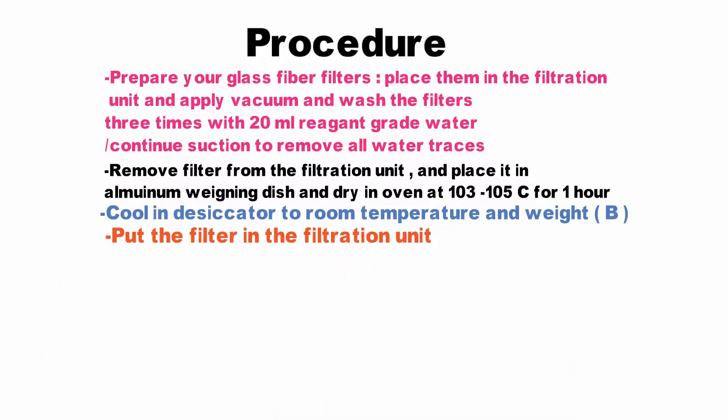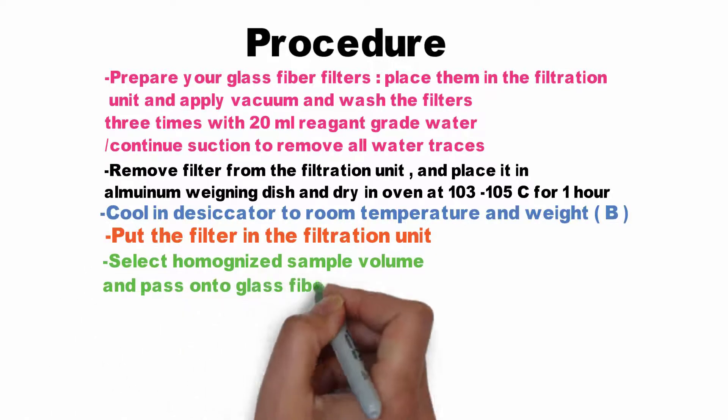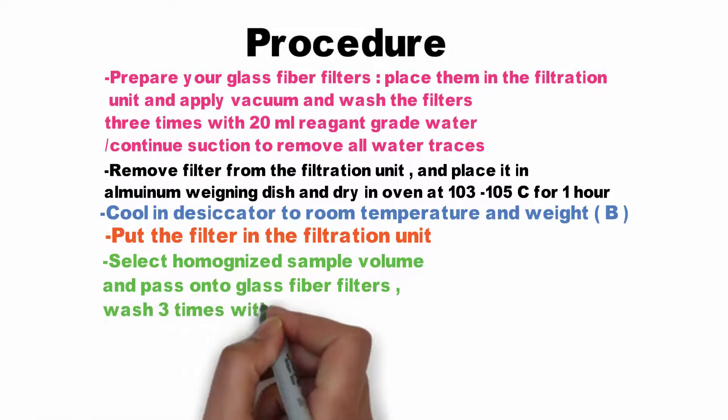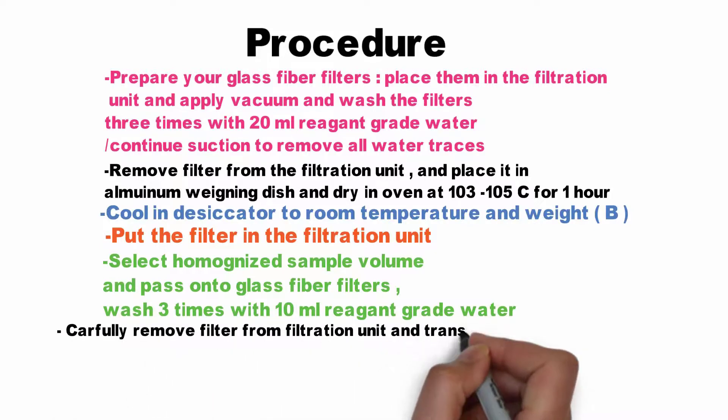Put the filter in the filtration unit and select homogenized sample volume and pass it onto the glass fiber filter. Wash three times with 10 milliliters reagent grade water. Now carefully remove the filter from the filtration unit and transfer it to the aluminum dish.